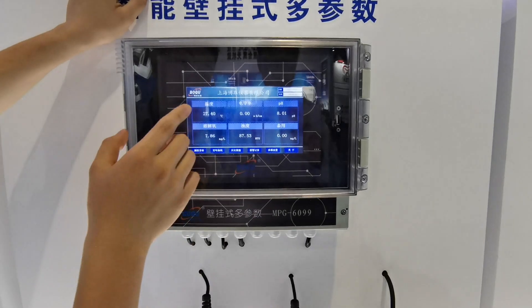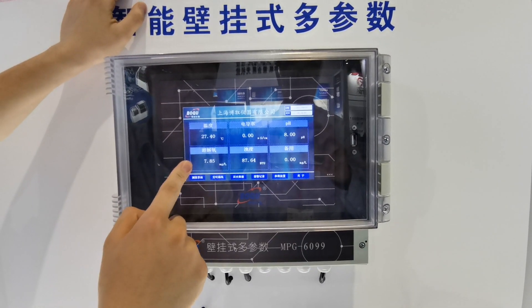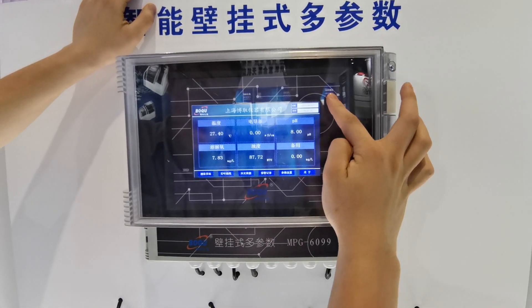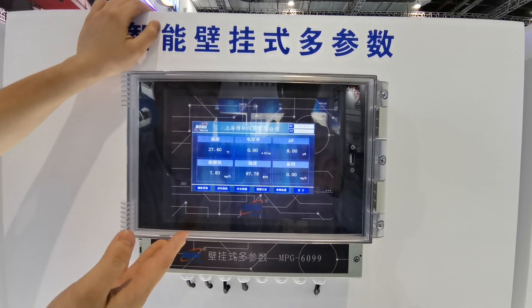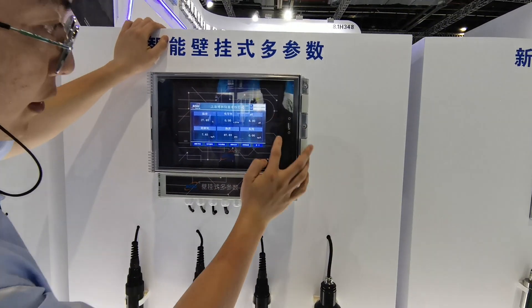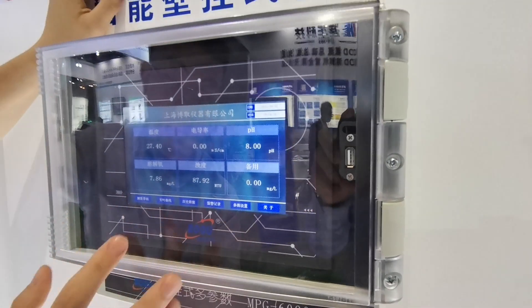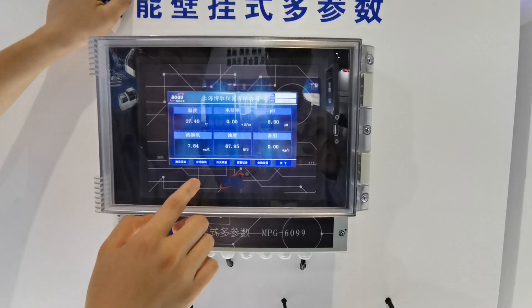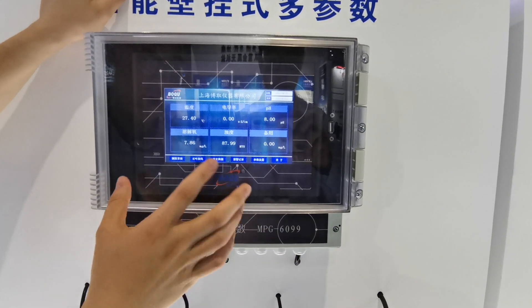Now you can see the temperature, conductivity, pH, and dissolved oxygen capacity. The date and the time is also shown here. It also has a USB function for you to download all the history data, and another function for the real-time curve for different parameters, with history storage.